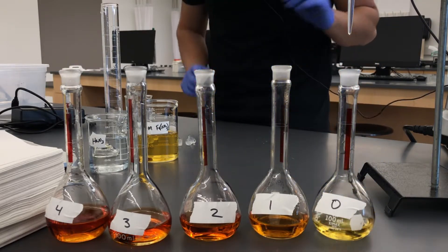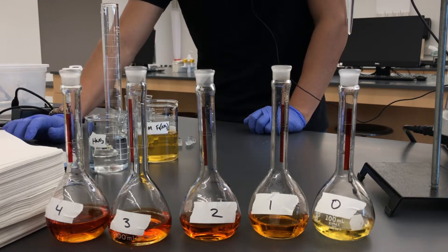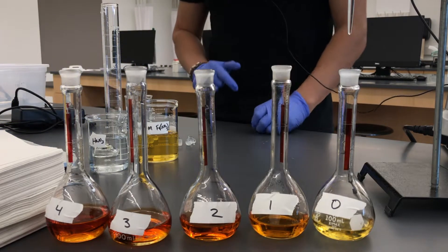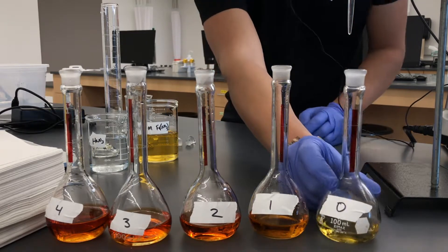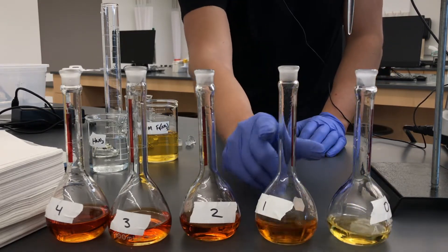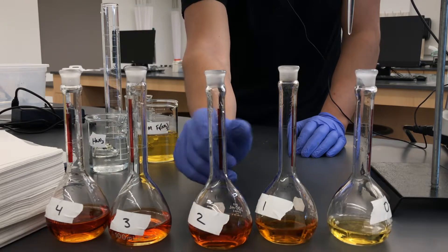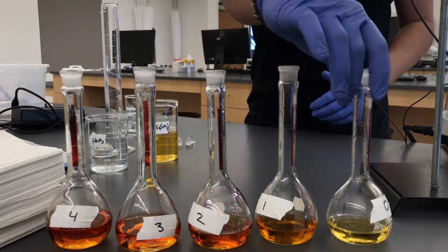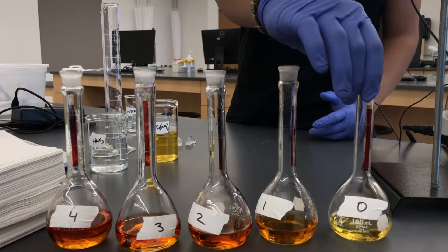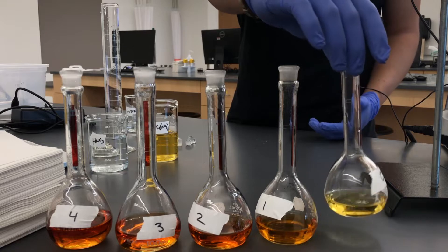You can see they all have a little bit different color. This is 0, that's our blank. Now we're going to fill them all the way up to the marks with nitric acid and then we'll mix them properly. So to the marks are wherever the line is up here at the top. Each volumetric flask has a different mark of 100 mils.